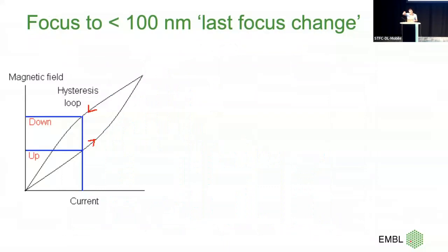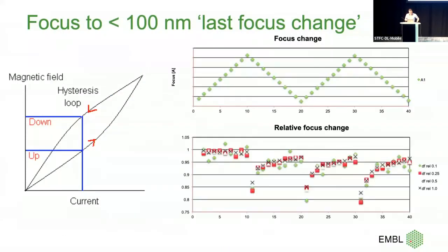I analyzed drift data from tilt series — tilt angle on X, drift in nanometer per second on Y — and for K2 I had to be careful. Focusing has a problem: when you adjust focus there's lens hysteresis, so depending on whether you increase or decrease the current you get a different magnetic field and a different focus value. I tested this by stepping up and down in focus at 0.1, 0.25, 0.5, and 1 micron steps. When you reverse direction it takes a while — you end up with about 80% of the step on the first correction.